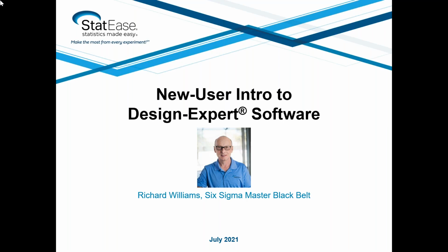But let me go ahead and make a few introductory comments to let you know what this is all about and what to expect. This is for new users for Design Expert. The idea is to introduce design of experiment concepts and also to introduce StatEase Design Expert software for the creation and analysis of multiple types of experiments.